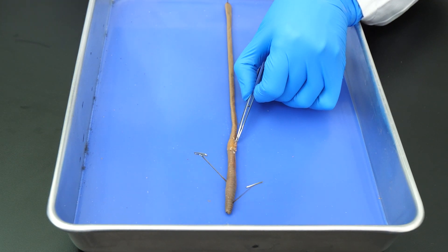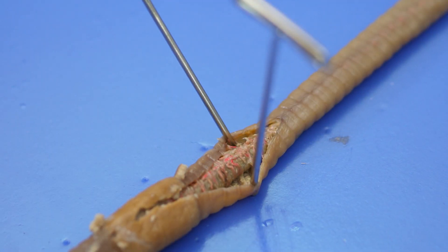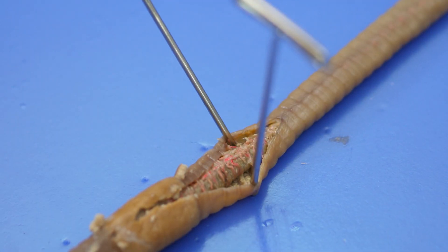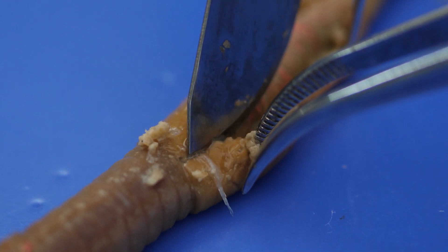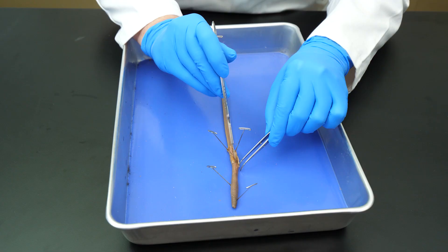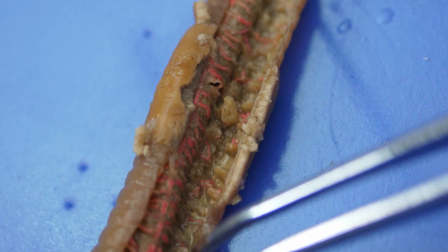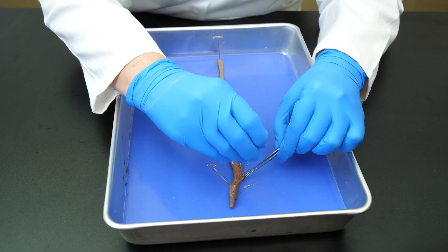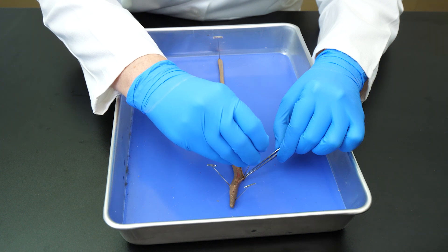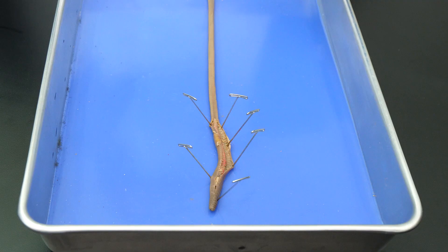Before we can cut the septa, we need to stick another pin into the worm. As before, we place the pin through the skin on the side of the worm to avoid further damage to the internal organs. Next, we hold the skin on the opposite side with the forceps and use the scalpel to cut away the septa a little at a time. After cutting several of the septa, a section of the skin is released, so we need to pin down that skin to hold it in place. Notice that we are sticking the pins in at about a 45-degree angle — this will expose the coelom but keep the pins out of the way.